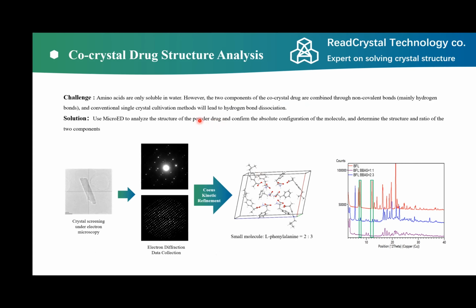Co-crystallization is a technique that is quite useful in drug solid state research, because co-crystallization can alter the solid state characteristics of the active ingredients without changing the structure.